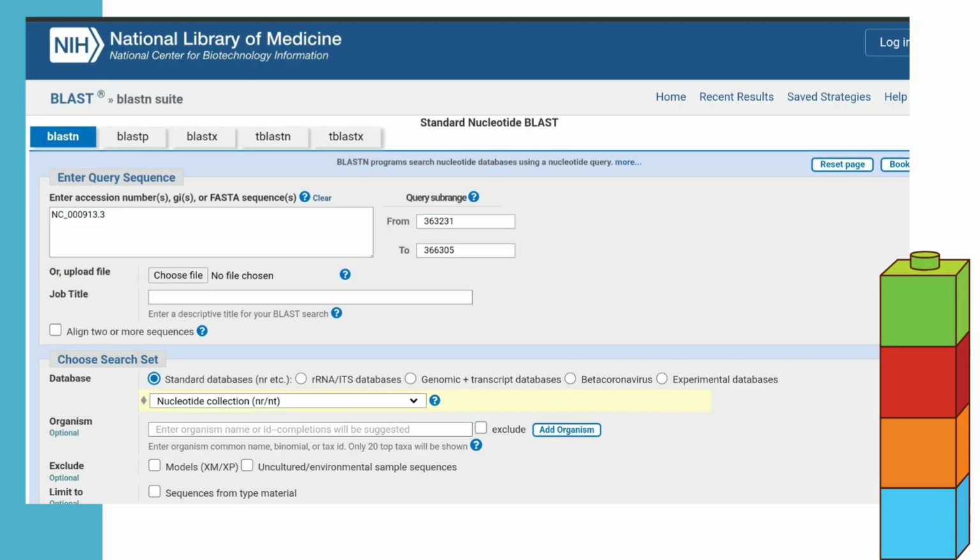As I click the Run BLAST option, I jump into this page directly. You can see the accession number of the gene, and now we can go for BLAST.